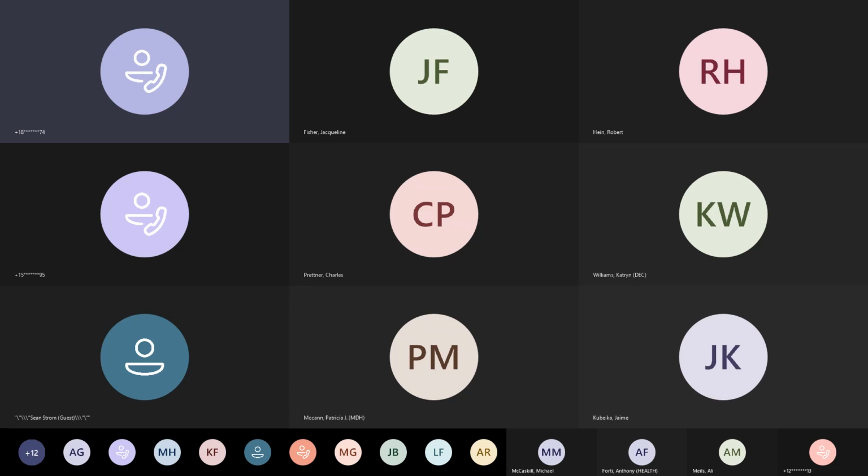And you've got to think of it like a semi-VOA or a volatiles method, you know, 8260 or 8270, in that you can only optimize so much for a huge analyte list, especially with PFAS, where they all behave kind of wonky sometimes. Some of them behave wonky and don't really follow a pattern necessarily in their behavior. So it really is going to be a matter of what can you live with on some of the analytes with recoveries and extraction efficiencies and such. But for the most part, I'd say they look pretty good. That's fascinating. Thank you so much.